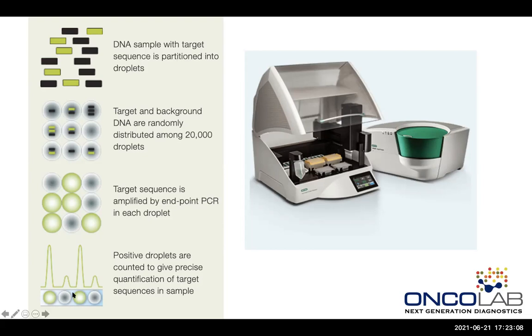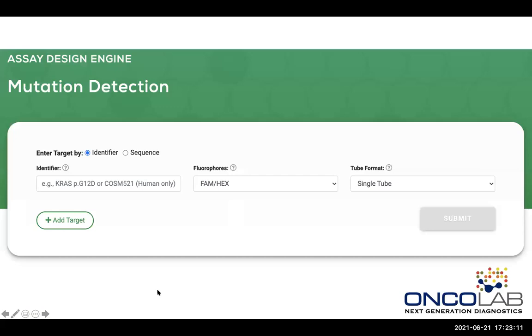The other nice thing that Biorad has done is their website. They have over 2,000 wet lab prep kits. So you can go and put in the mutation that you picked up, and it will immediately tell you these kits will detect it, and you can order the kit. The kit is literally a set of primers, so it lasts forever. So one can potentially build up this whole library of mutations that you can test for fairly easily. So we did this with a solid tumor thing, and it worked very well. Afterwards, I got brave and tried to set up my own assay for NPM1 mutations, and it failed miserably.